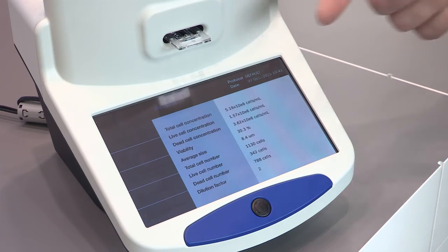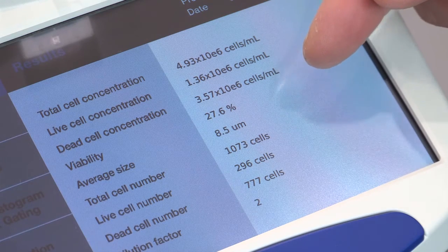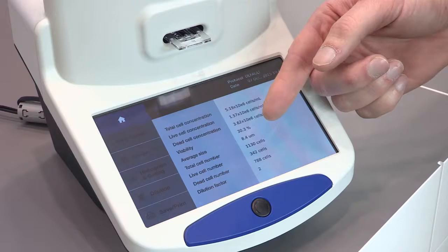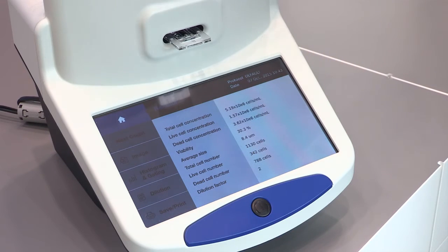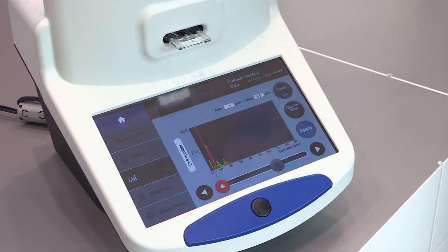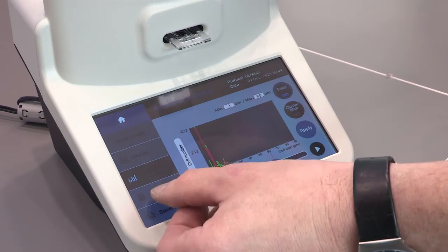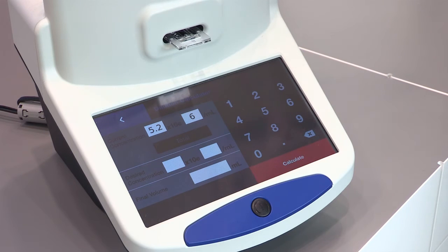As a result, you can see here the complete information about total cell concentration, live cell concentration, dead cell concentration, viability, and average size — so any statistics around the cell culture is given within 15 seconds. You also see a histogram showing the distribution of different cell sizes in your cell culture.